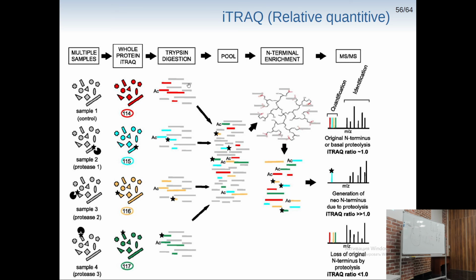Another idea: after trypsinization, we can label our samples with some addition and then fragment it. All the different ways to have this quantifiable approach are to add some label to our sample that can be visible in our mass spectrometer. But this label shouldn't change the mass of our compound until we have done our chromatography and our first round of mass spectrometry, and only in the tandem spectra should there be some differences. So that's how it works.